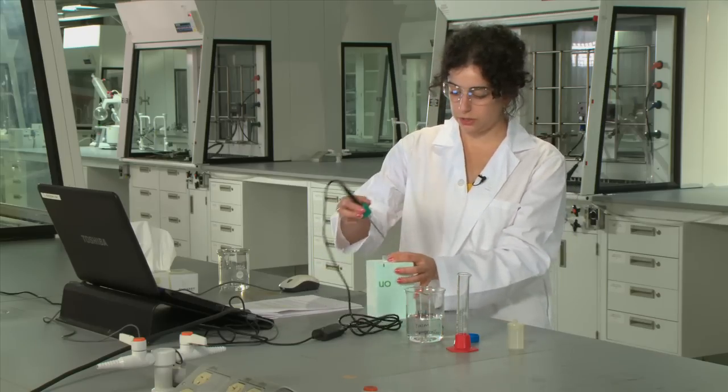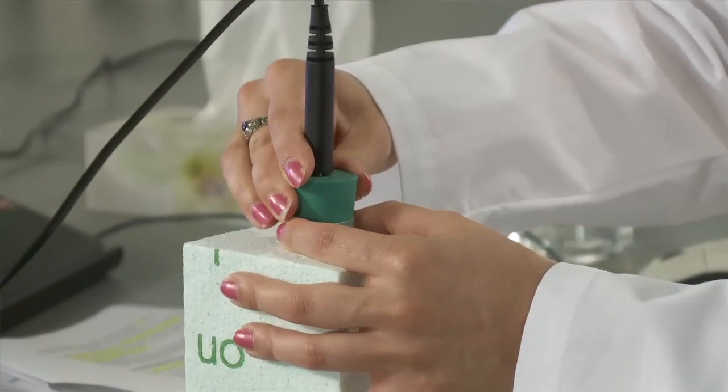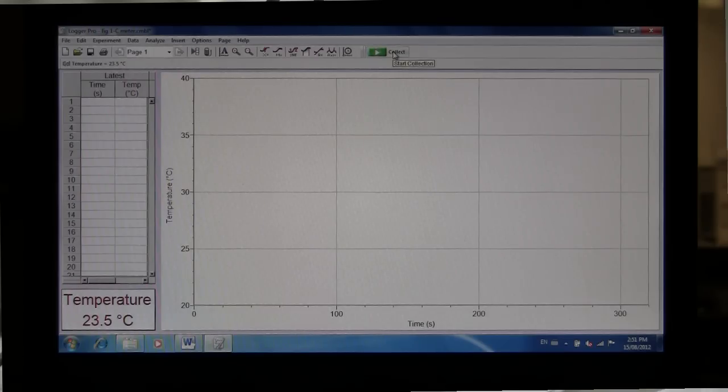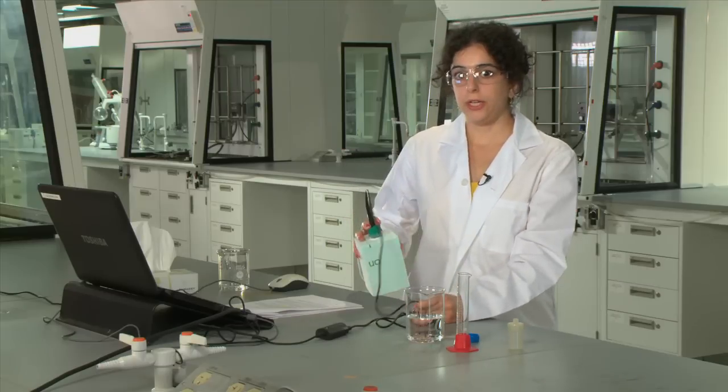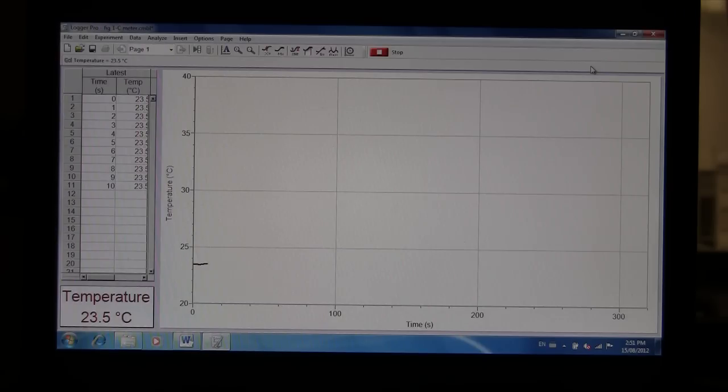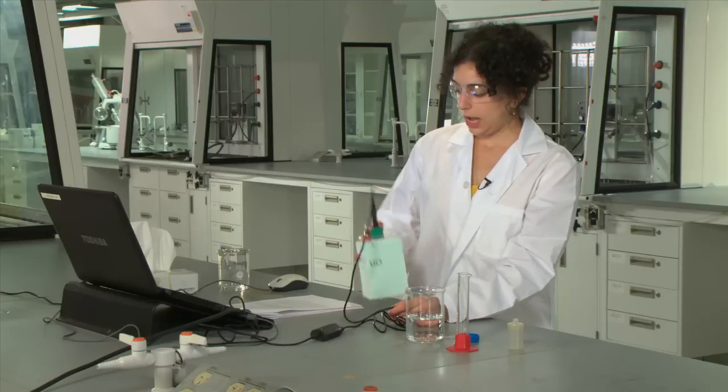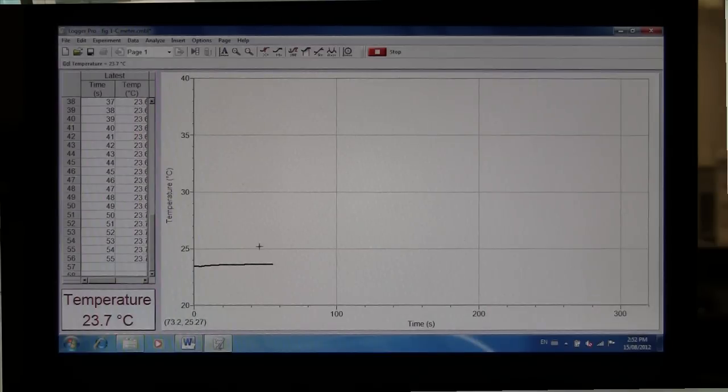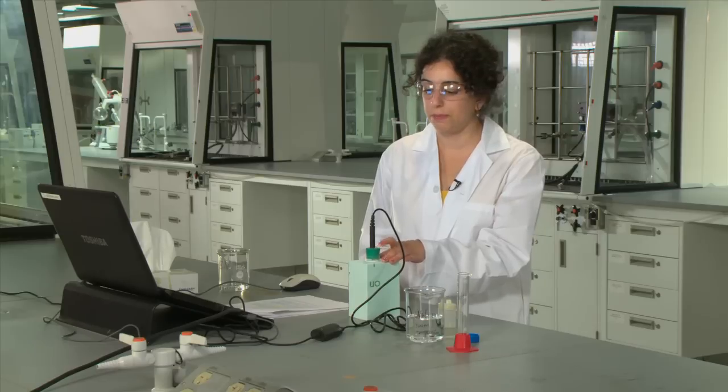Replace the probe like you did in the first part and then in Logger Pro software click collect. Hold the calorimeter again like you did previously and shake for about 60 seconds. Let it stand for 100 seconds or when the graph has somewhat stabilized. Take a reading and record this in your notebook. This is the initial temperature of the calorimeter with the room temperature water inside.